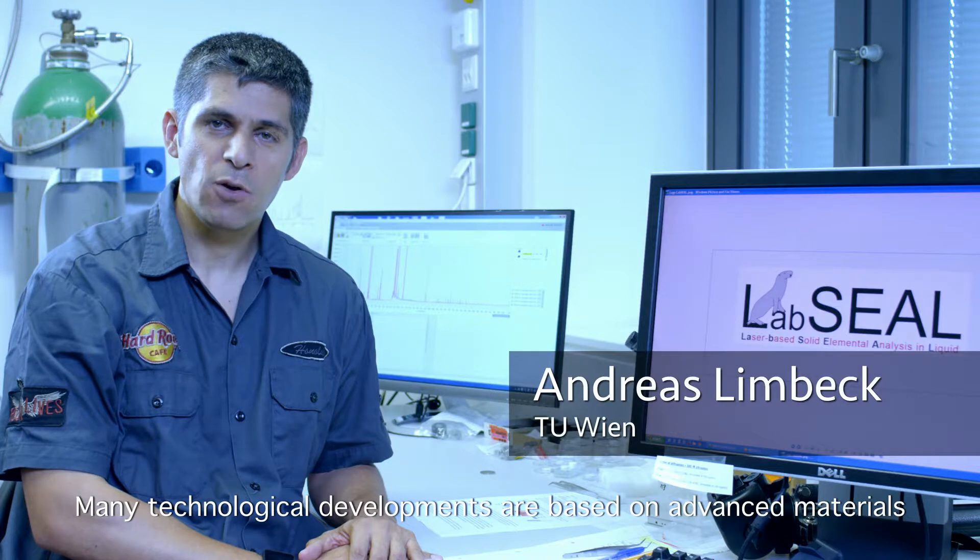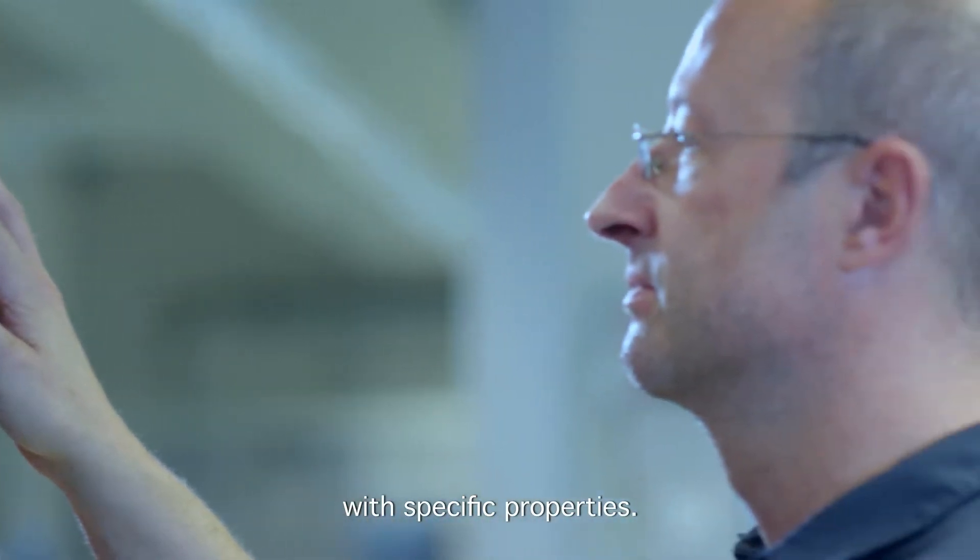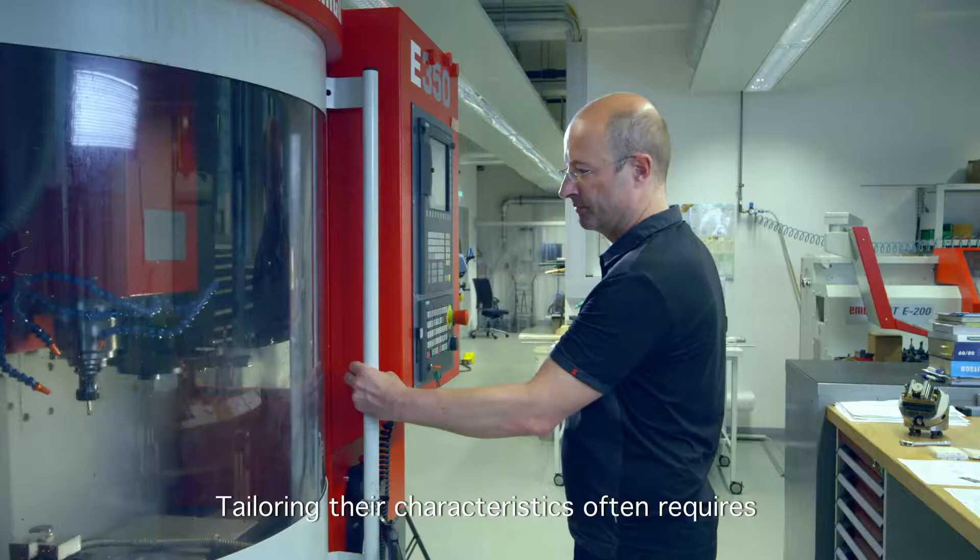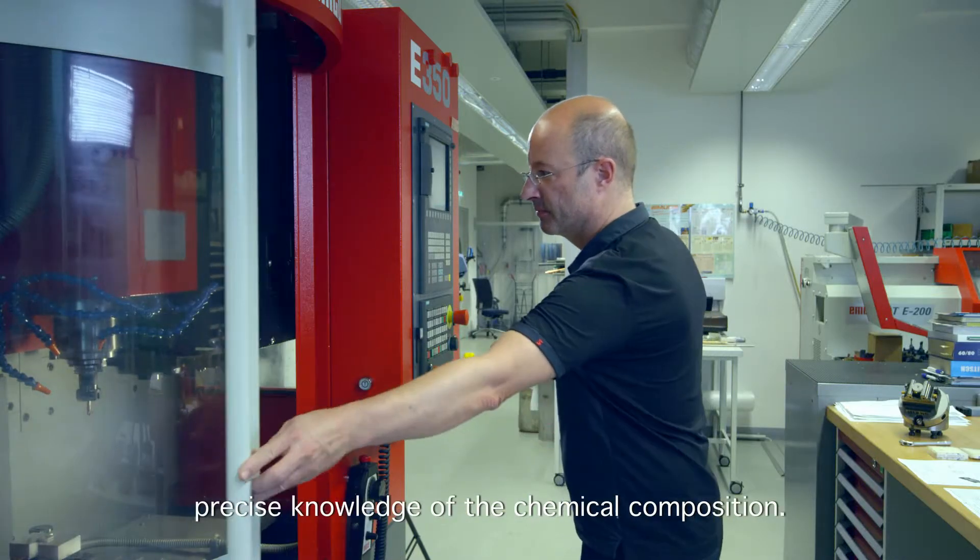Many technological developments are based on advanced materials with specific properties. Tailoring their characteristics often requires precise knowledge of the chemical composition.